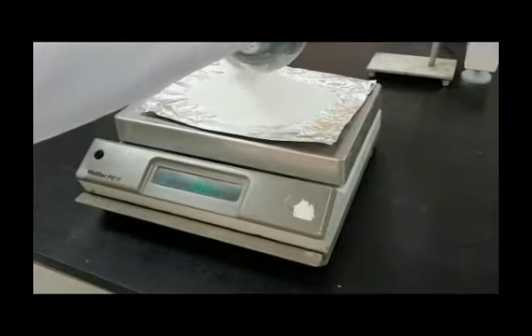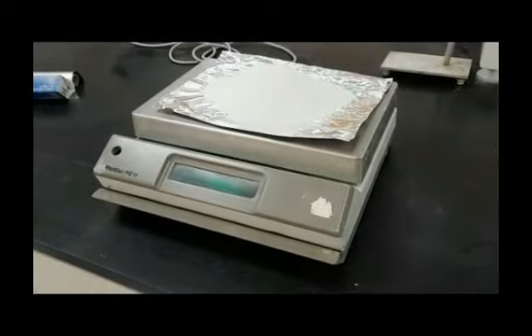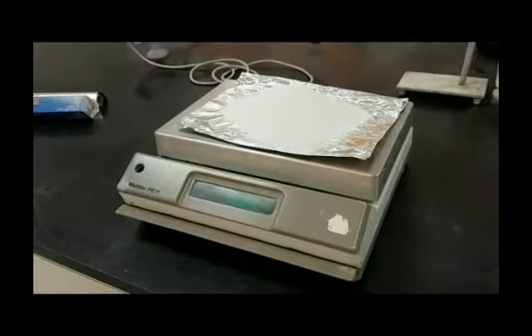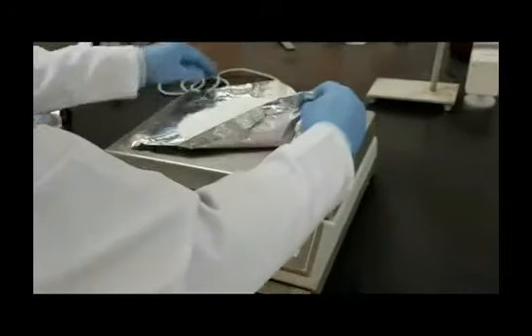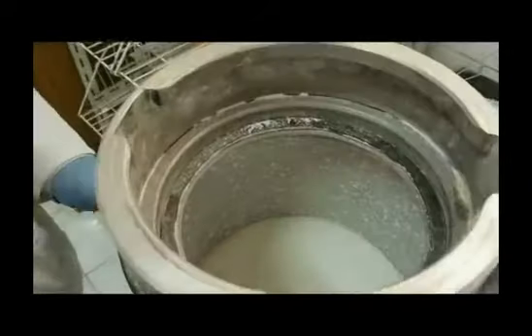Remember, you can add the grinding medium in the specified ratio before or after adding the powder to be milled in the bowl mill milling chamber — that is, before or after the addition of the coarse sucrose. Here, we are placing the sucrose first, then adding the grinding medium in the specified ratio of small to large balls, three to one.